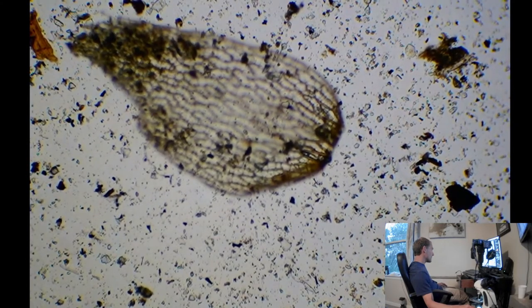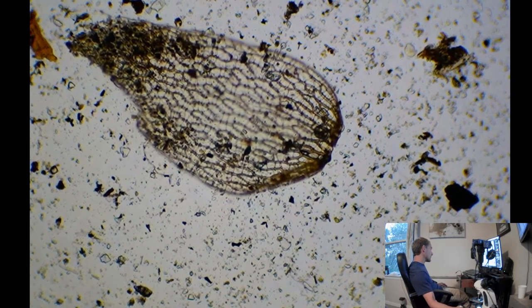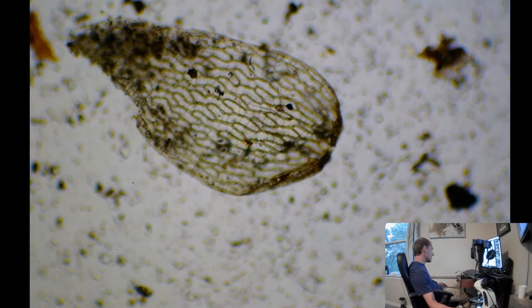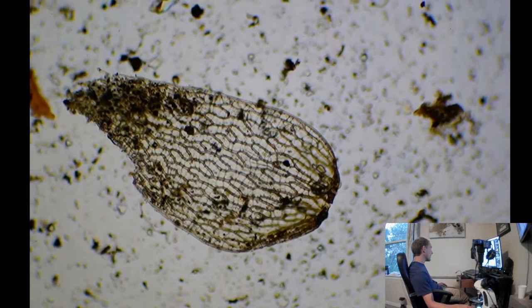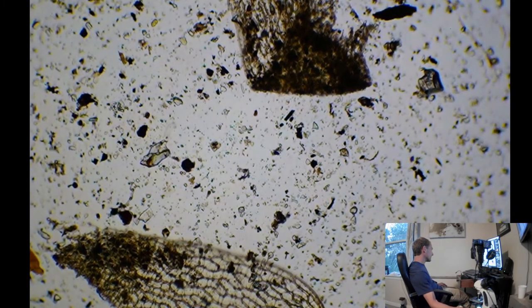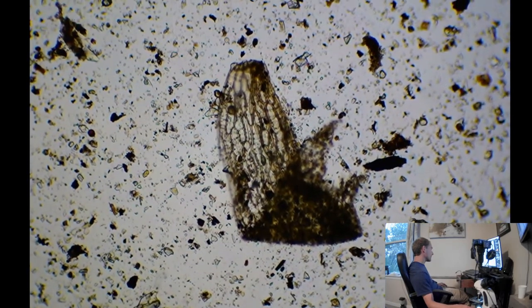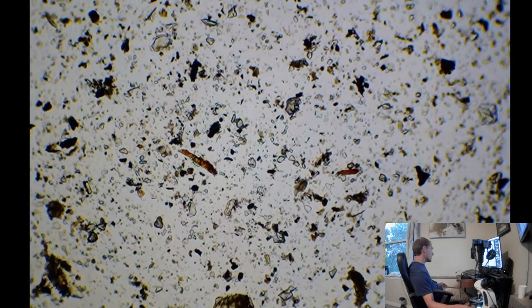I see somebody moving there. Yeah, that's just a little small piece of leaf. Pretty cool looking though. All the little plant cells. Yeah, but you definitely want organic matter in your soil.